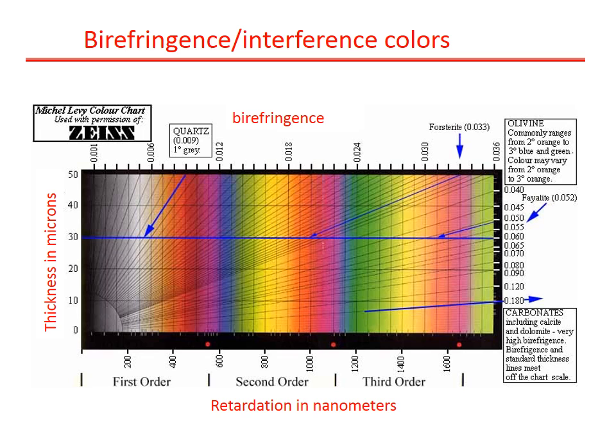Quartz has much lower birefringence, and it only has interference colors of first order white. So this is actually how thin sections are normally tested for thickness. The rock contains quartz. The person preparing the section will check the interference colors of the quartz and will continue to grind the slide down until it all has an interference color of white. Anything higher, so into the cream or yellow colors, and they'd know the slide was too thick and they should keep grinding it thinner.